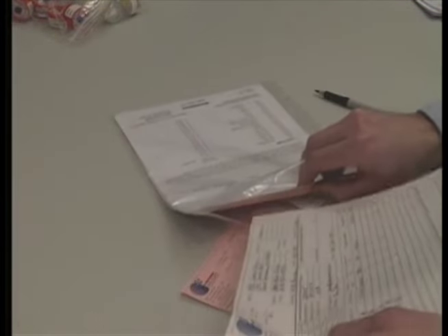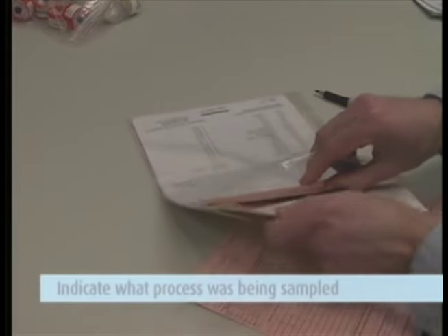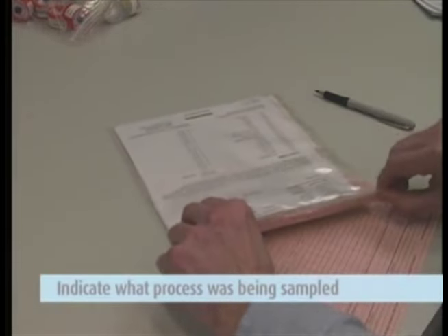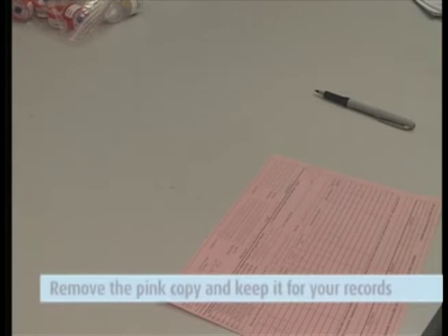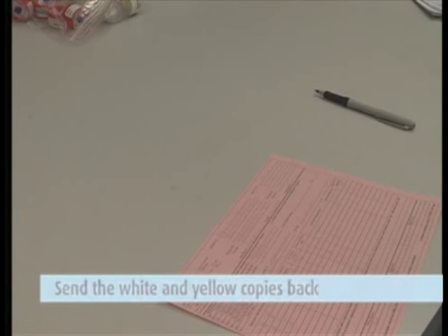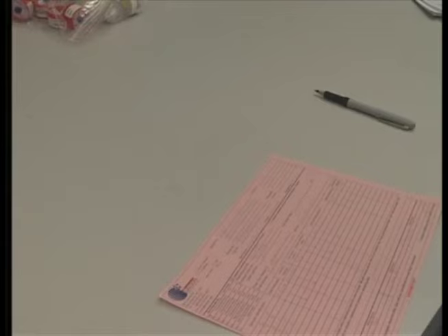Then, complete the chain of custody form. It is important that you include all the information requested in order to ensure the turnaround time of your samples. Please indicate what process was being sampled, such as welding, electroplating, etc., in the comments section of the chain of custody form, removing the pink copy and keep this for your records. Send the white and yellow copies in with the samples to the lab in the large Ziploc bag.